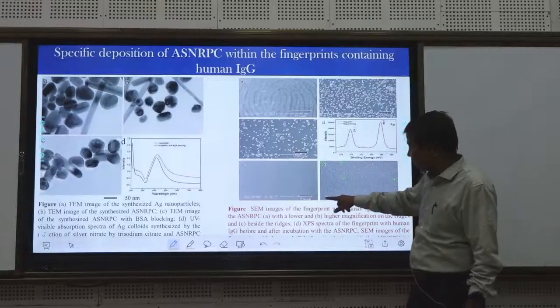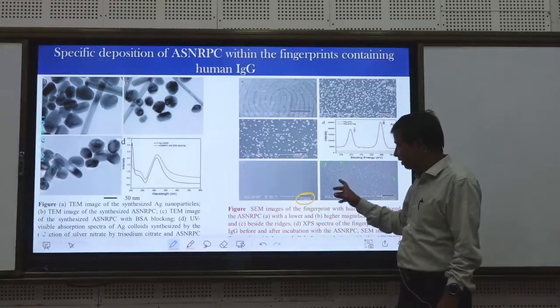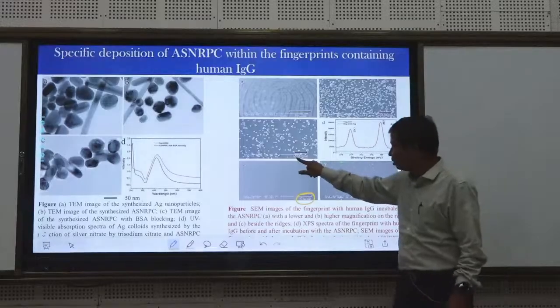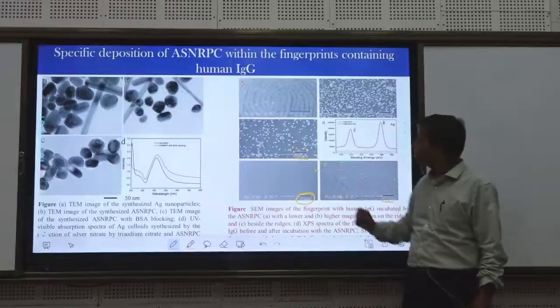Similarly, this is 1 millimeter. A 1 millimeter bar you are seeing. It's a very unzoomed one. This is again 500. So you see this is 500. This is also 500. So this is smaller. This is bigger.